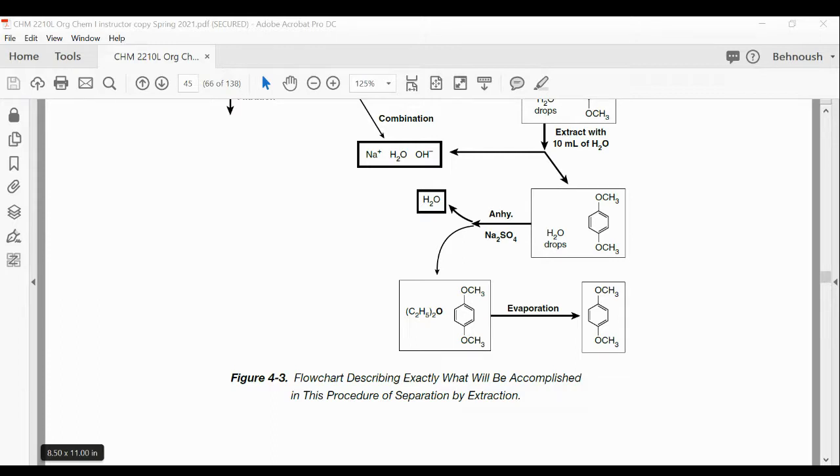And at this point, it would be really nice to do research to find out what is the maximum recovery for extraction of benzoic acid if you choose 3 10-milliliter portions instead of 2 10-milliliter portions, or using 3 5-milliliter portions instead of 3 10-milliliter portions. And yes, it is right. If it gets saturated, it's not going to bring in any more.